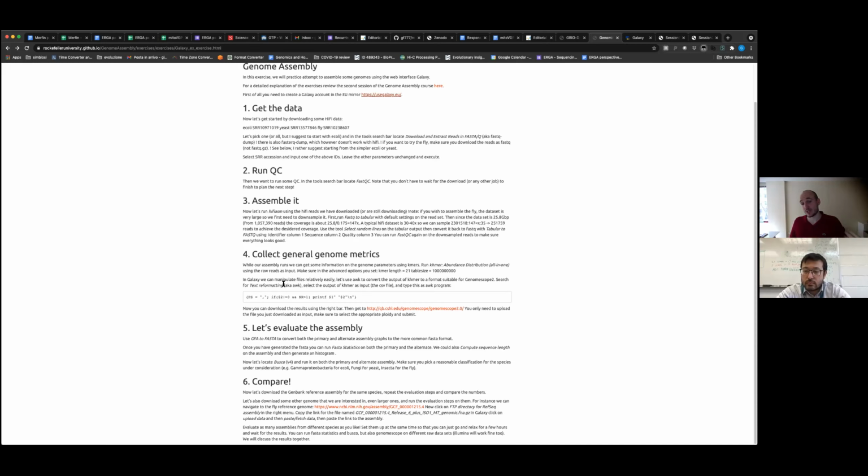You can always make a pull request. So if you have a specific tool in mind that would be helpful for you, you can ask the Galaxy developers to implement it for you. They can actually be pretty fast and efficient at that. But otherwise, you maybe have to play with the tools that are available to get to the results that you want.